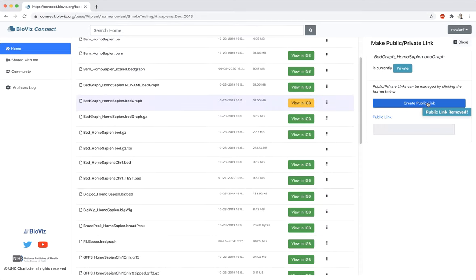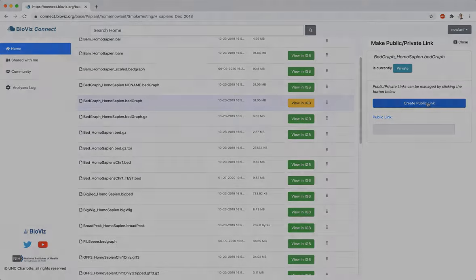Note that you must own or have right privileges to a file in order to make that file public or private.